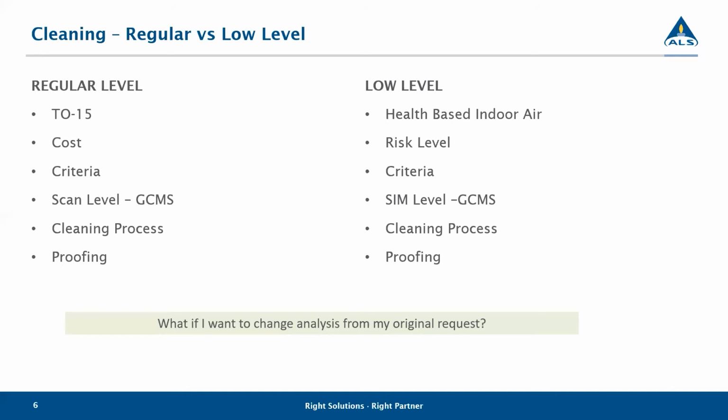But the only way for us to determine that for certain is for you to get back to us and let us know what you want to change. If we can't change, then we would have to switch out the canisters. You send us back what you've got, and there is a canister return fee, and then we send you what you do need. So just keep in mind that it's not impossible to change.